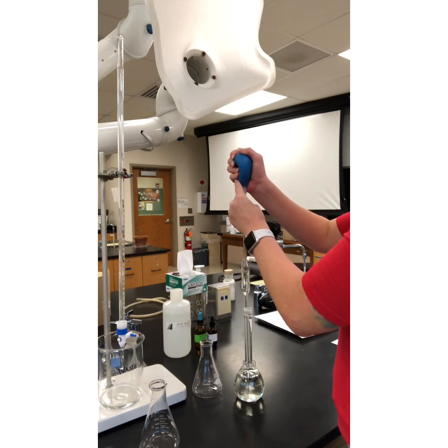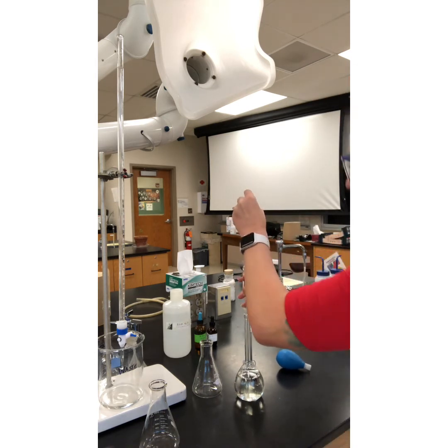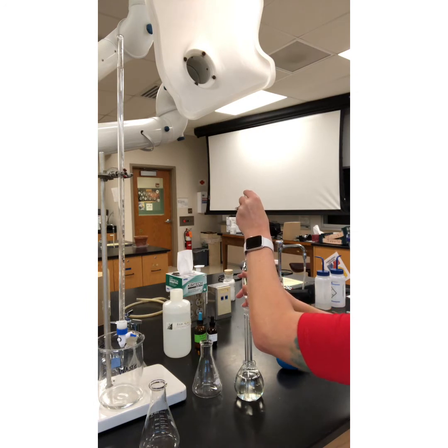Drawing my solution up. Oops, there we go. All right, again, my line is right about here. My solution's up to there. Let's go ahead and slowly let it out.